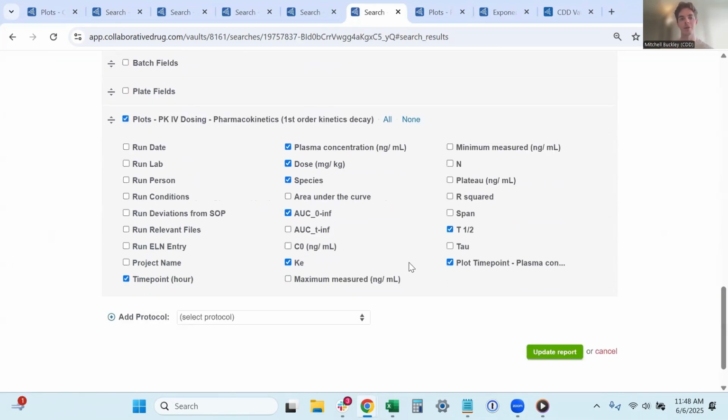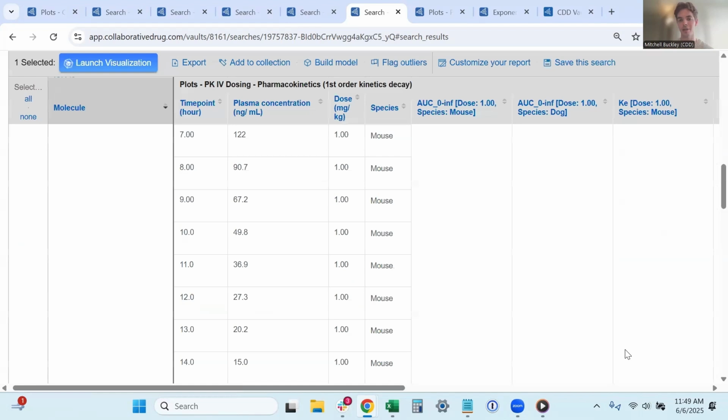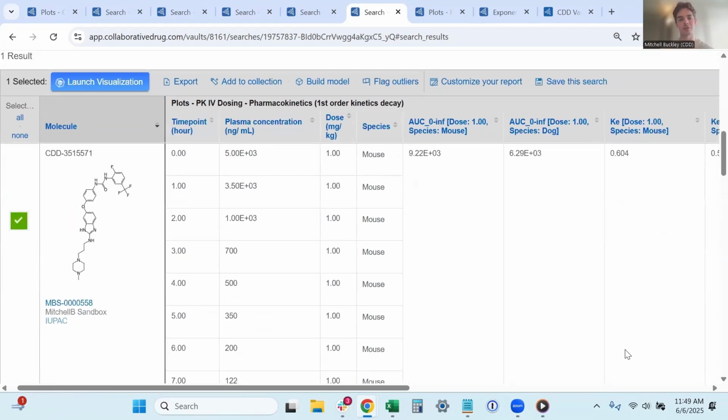the auto-calculated parameters for this specific IV protocol. And so you'll notice we do offer three different AUC calculations, this first one being the AUC observed, so just for our time points that we've specified, as well as a handful of other highly useful calculations. All of these auto-calculated parameters, of course, can be referenced in further calculations. So you may want to calculate clearance or volume of distribution. All of that can be conducted as a custom calculation.